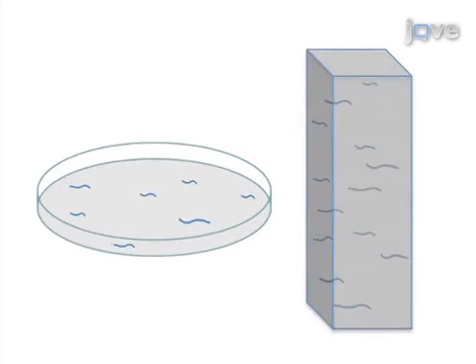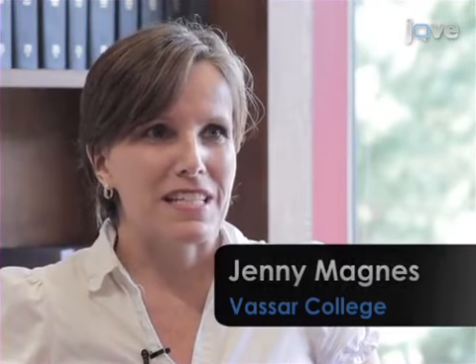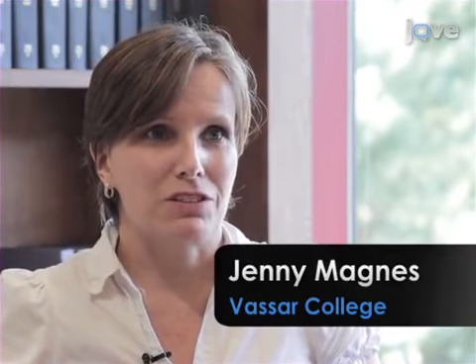Ultimately, diffraction analysis is used to show changes in locomotion patterns of unconstrained worms. The main advantage of this technique over existing methods like traditional microscopy is that swim patterns can be observed as the species moves freely in a three-dimensional space.